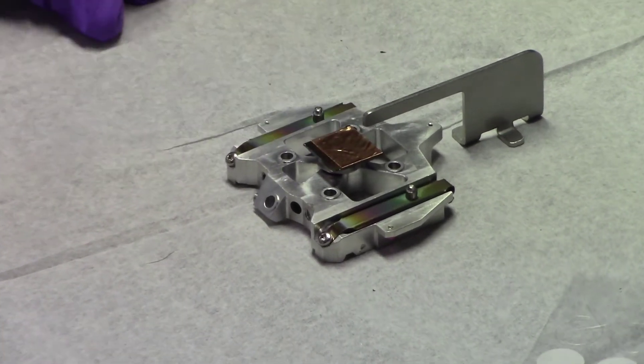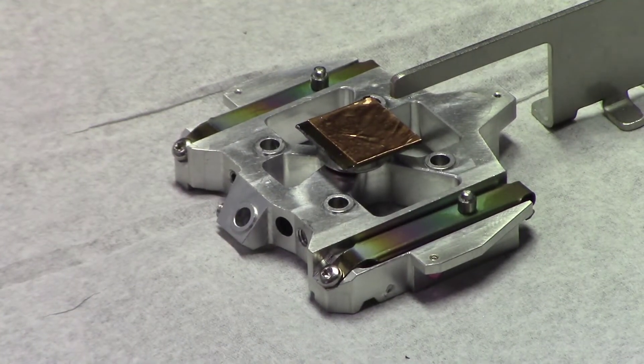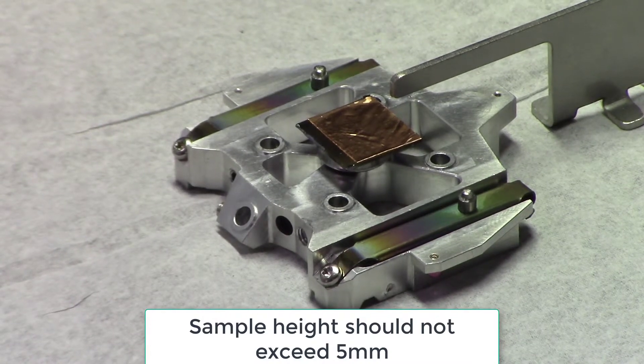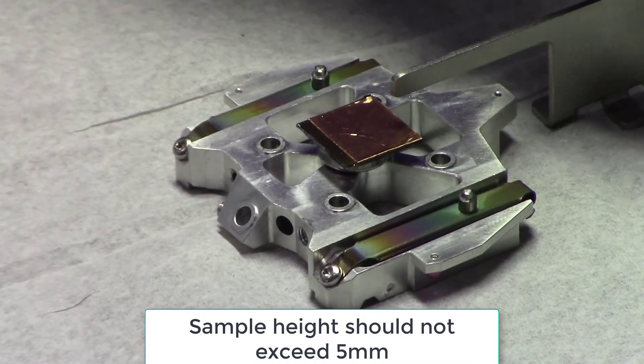Finally, use the height gauge to make sure your sample does not exceed 5 millimeters. Otherwise, it will not fit through the load lock.